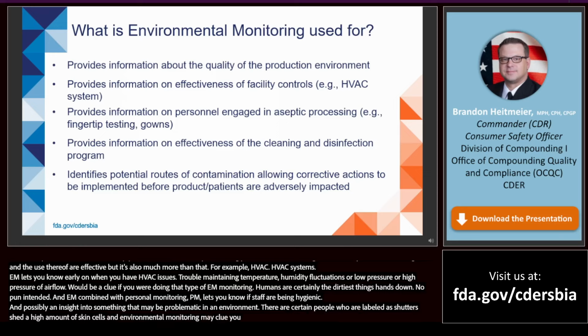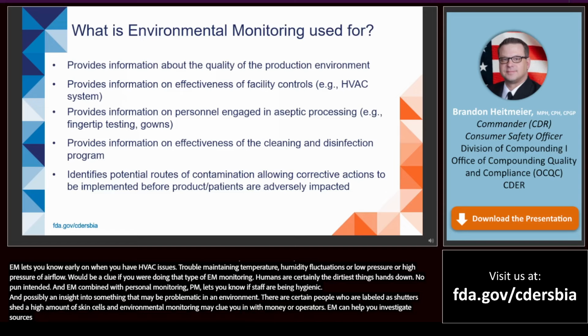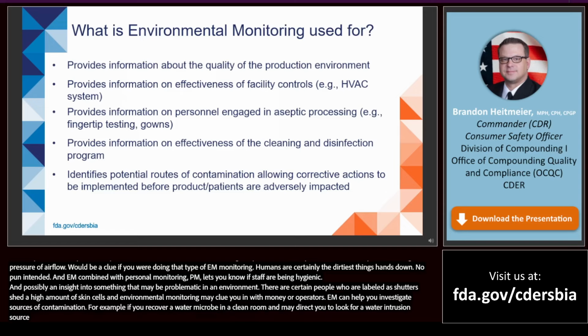EM data can help you investigate sources of contamination. For example, if you recovered a water microbe in the clean room, it may direct you to look for a water intrusion source. And then after doing such an investigation, you find out that you actually have a roof leak somewhere.